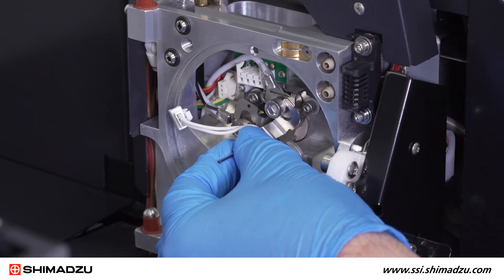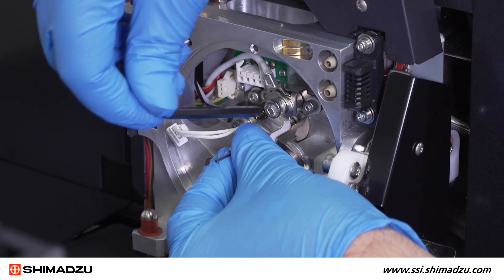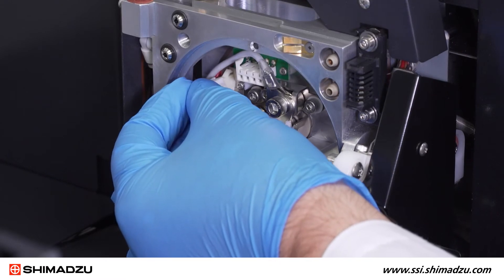Rotate the new DL counterclockwise. Ensure that the connector plates engage behind the two bolts. Using the hex wrench, securely tighten both bolts. Then reconnect the DL temperature sensor plug.